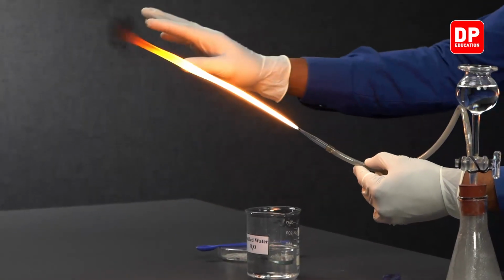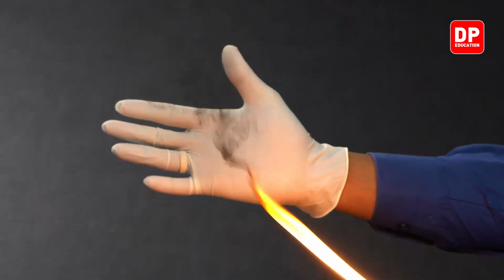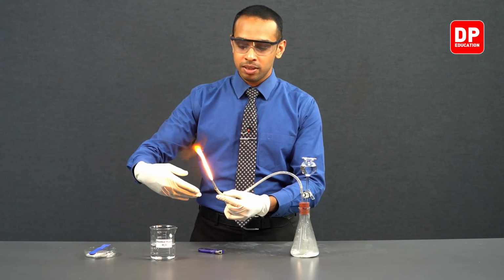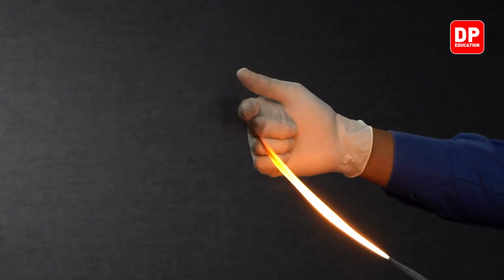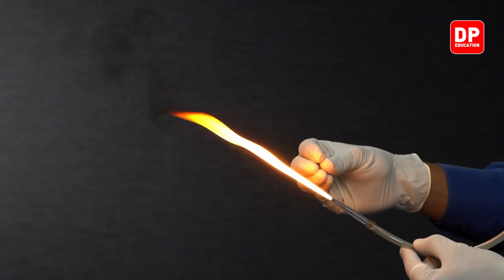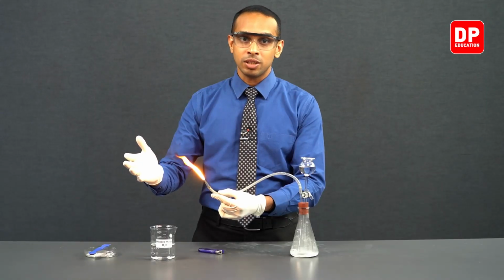So can you see the acetylene gas burns here, producing a sooty flame. So this entire flame that we have here is a sooty flame, students. This is because the carbon to hydrogen ratio in acetylene produces a high percentage of carbon.